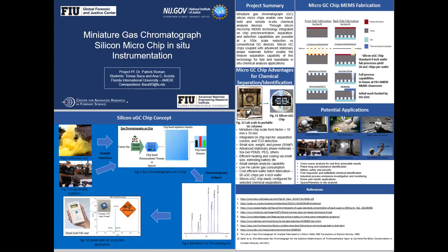And Tomas, just to reiterate, there was a question earlier before some other people came in. The carrier gas that you're expecting to use in this? It's helium. It's what is typically used for the carrier gas, so we're going to use that. As of now, that's what we decided on. I'm pretty sure it's the best solution.